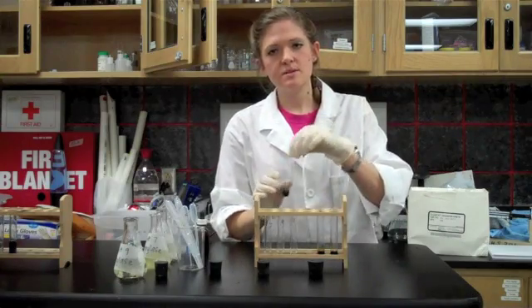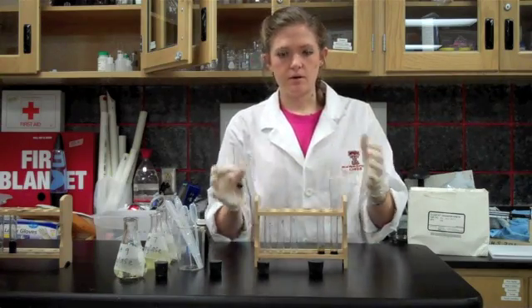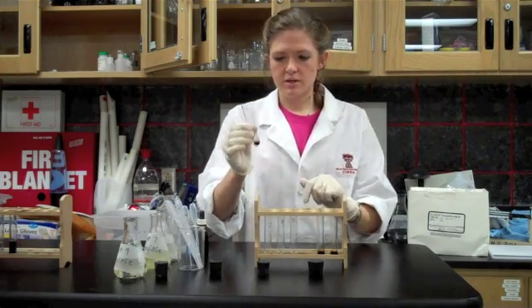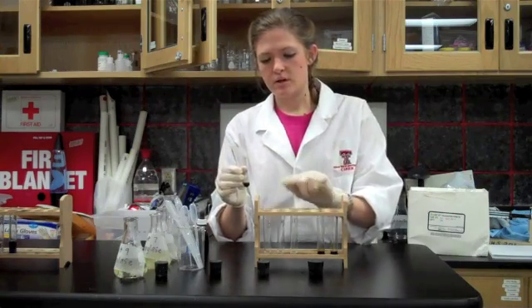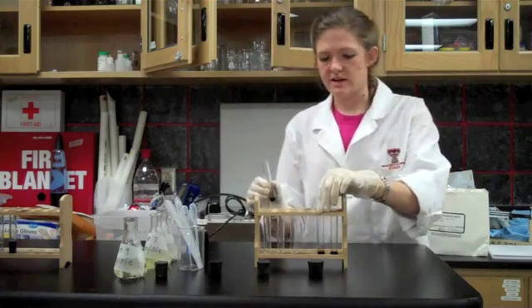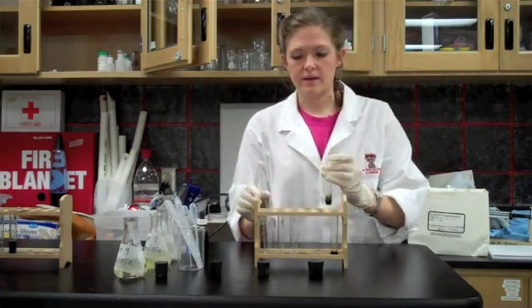At approximately the same time, I'm going to go ahead and add the starch solution with the iodine to each one of the amylase solutions. I'm going to have to do this quickly so that they all start working at the same time.